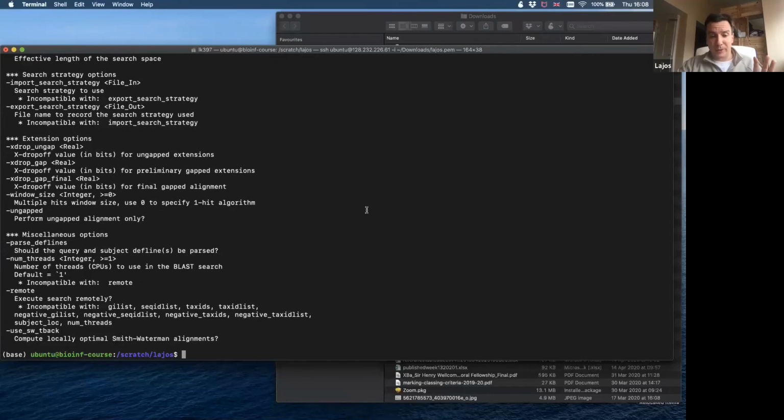So as you can see, if you use BLAST, you are looking for sequence similarity. There is an alignment step where BLAST tries to introduce gaps if it thinks that by introducing one insertion or deletion, you will have a much better matching between the two sequences.